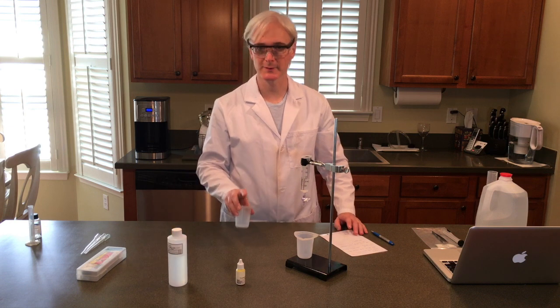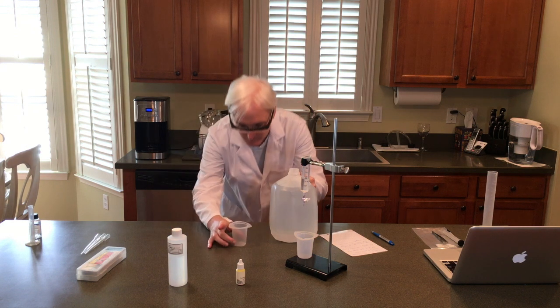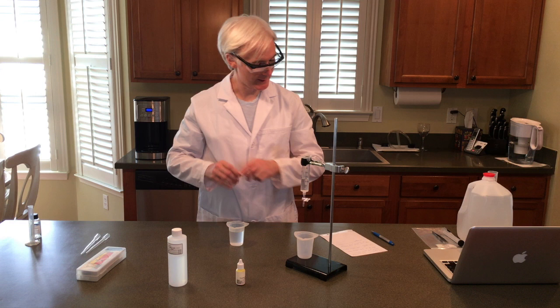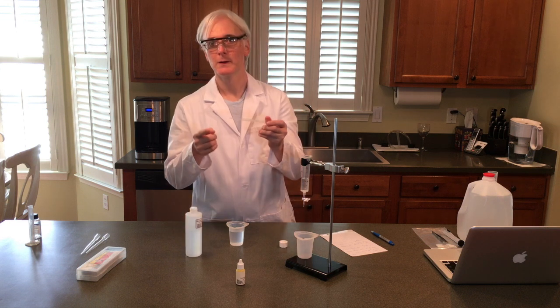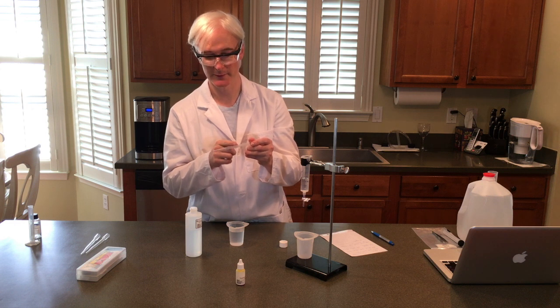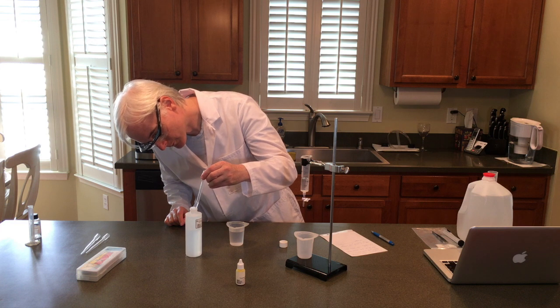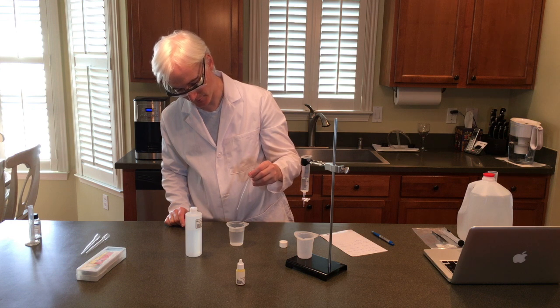Next we're going to take our beaker. We're going to add 80 mL of distilled water to that. And with the pipette, we're going to add 0.5 mL of acetic acid. You will see on the pipettes that they do have markings — this one has a 0.5, one milliliter, two milliliters, and also the half milliliter markings. So we're just going to take it to the half milliliter. And we drop that into the beaker of distilled water.